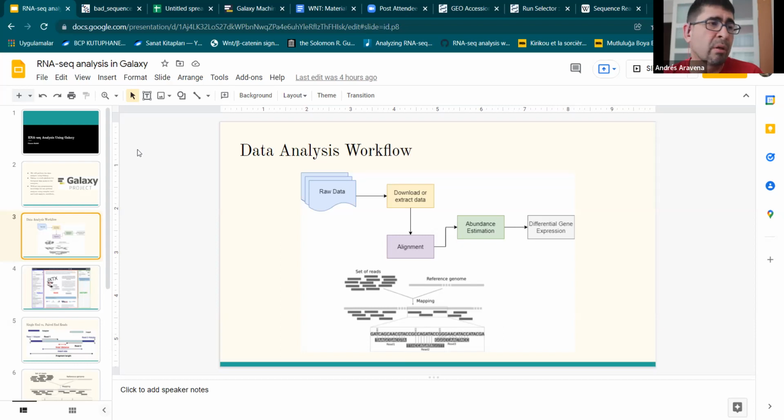More exactly, there is some chance that that will happen, but that chance is independent of the condition. And since we are doing differential expression, we may be missing some counts, but the probability that we miss them is the same in every condition. Of course, to have a complete answer I have to do it and compare. But a priori, I would guess that it's not a big deal.